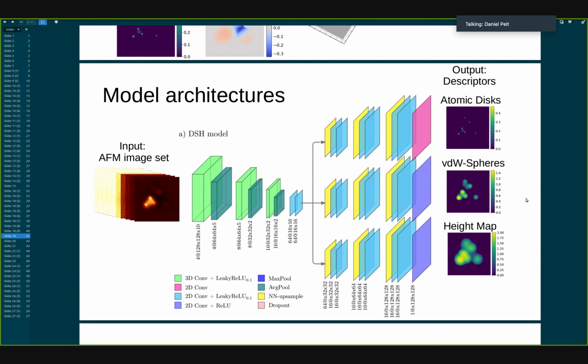Even normalizing gets tricky, because if you have a lot of high molecules, then your height map suddenly becomes very strong compared to the other ones. So everything gets a bit complicated. Maybe you could still combine the network but train it separately, which might work better as well. At least it would avoid these getting stuck problems. Anyway.